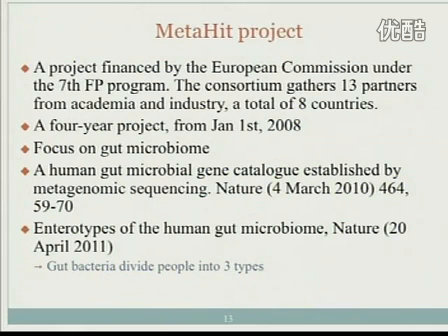If you already have those genomes sequenced, you can definitely do that. You can do quantification, but it's really complicated. I will mention a few of those challenges: how to make sense of a mixture of DNA sequences from different organisms.